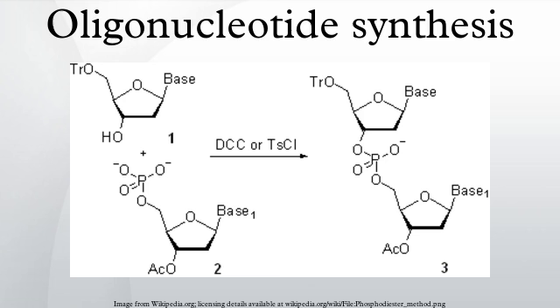3-((Dimethylamino-methylidene)amino)-3H-1,2,4-dithiazole-3-thione, DDTT, provides rapid kinetics of sulfurization and high stability in solution. The reagent is available from several sources. 3H-1,2-benzodithiol-3-one 1,1-dioxide, also known as Beaucage reagent, displays a better solubility in acetonitrile and short reaction times.